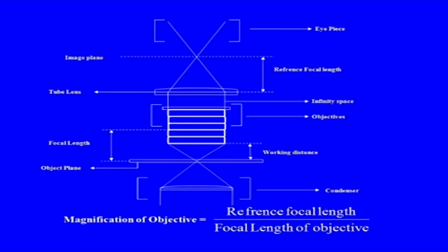Essentially, when you have to determine the magnification of the objective here, you have to take two things.